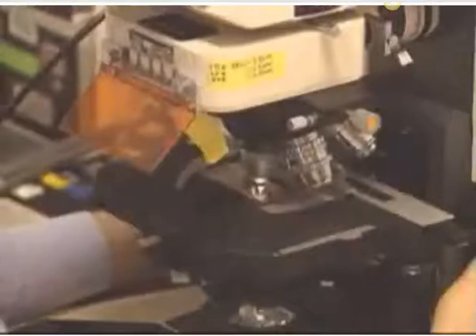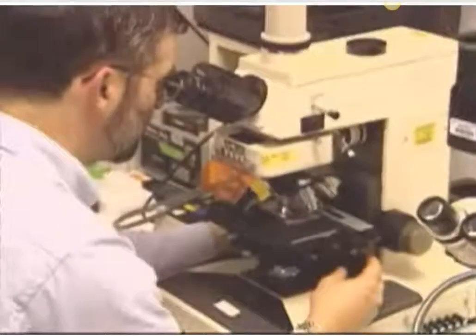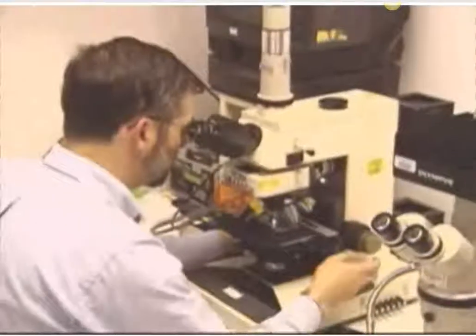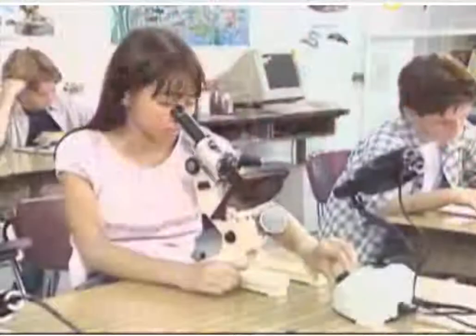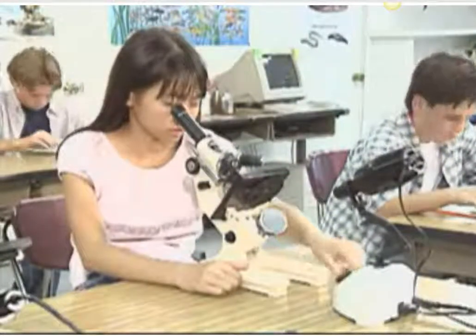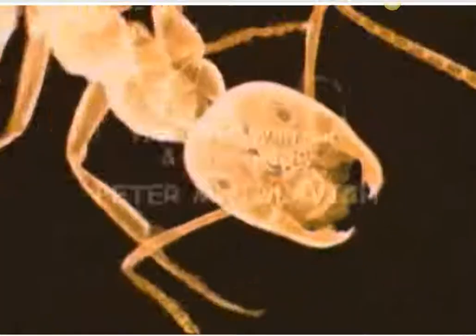The microscope has contributed to the cures of countless diseases and is today an important research tool, both the light microscope as well as the electron microscope. The microscope is also a passport, not to exotic foreign countries, but to an incredible miniature world.